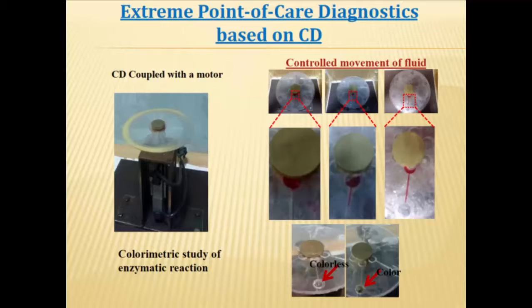We can use the existing material for electrodes for biochemical, electrochemical sensing. But again, integrating that electrode here will be costly and not that compatible. So we thought of using carbon MEMS technology to make carbon electrodes, because carbon is very much biocompatible.